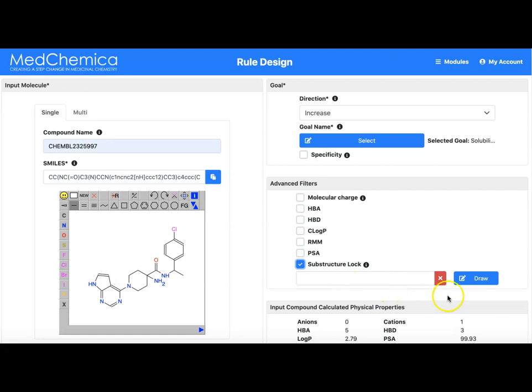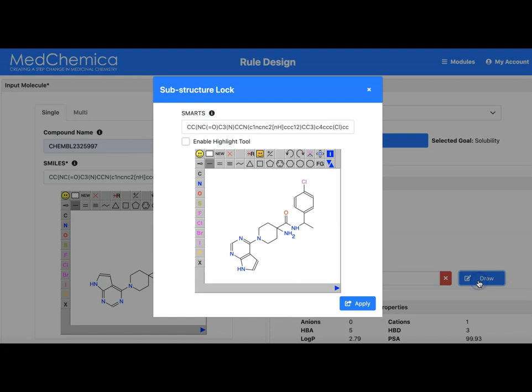To set the substructure lock you first enable it. You then click the draw button and a lightbox window opens with a copy of the input structure ready for modification.